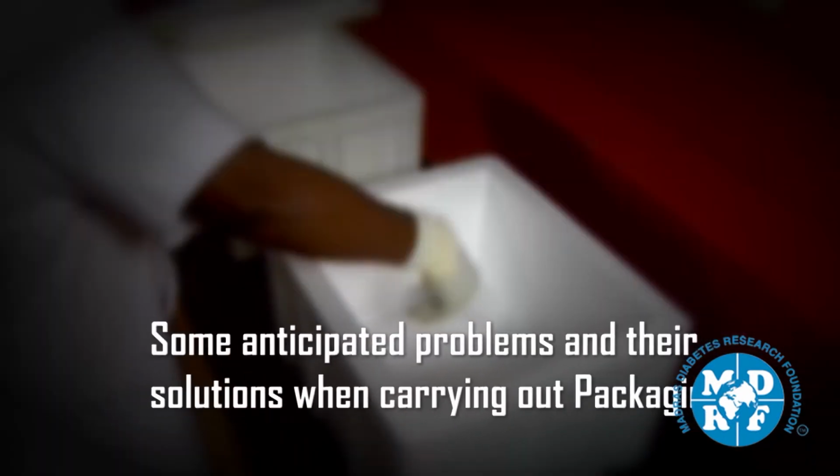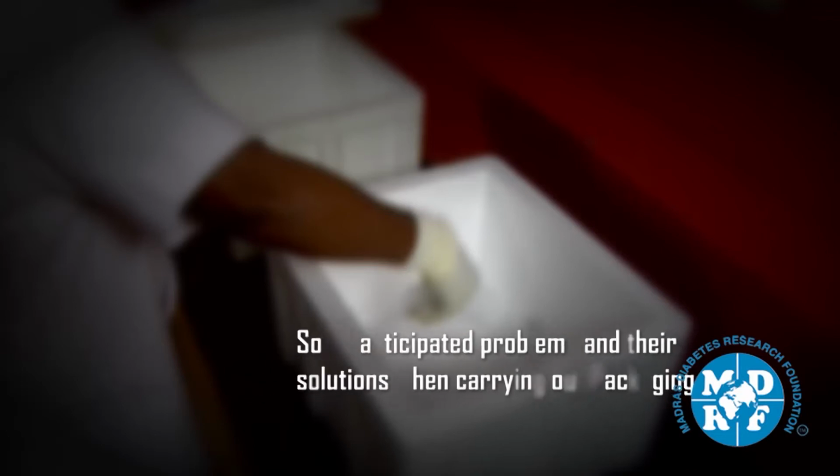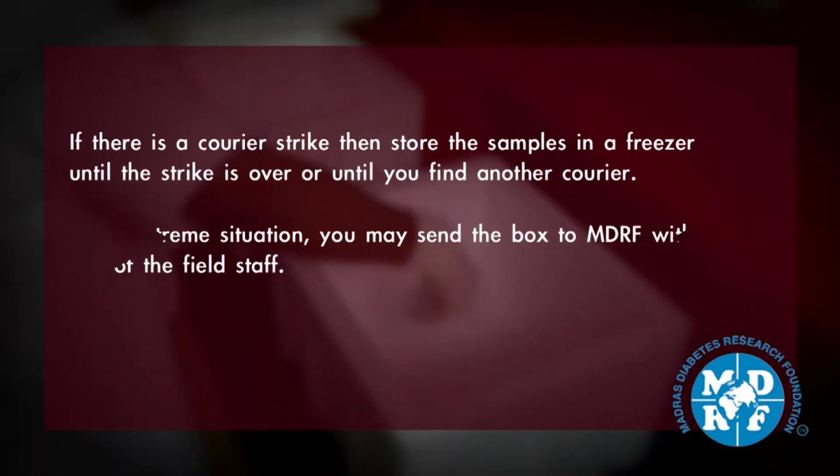Some anticipated problems and their solutions when carrying out packaging. If there is a courier strike, then store the samples in a freezer until the strike is over or until you find another courier. In an extreme situation, you may send the box to MDRF with one of the field staff.